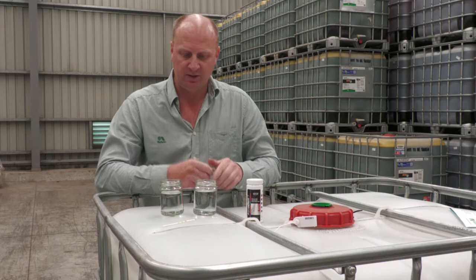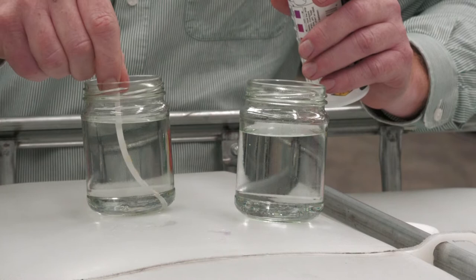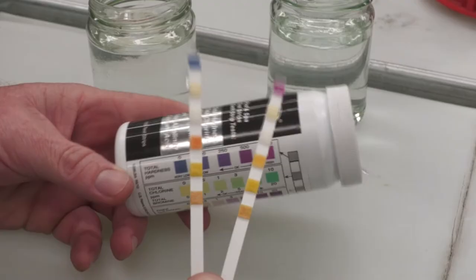We'll just have a sample here — we've got some rainwater on this side and some hard water on this side. We just grab our little strips out, dip the strip in the water, let it soak in for a few seconds, bring it out, and you've just got to give it about 15 seconds so we can see the colours come up.